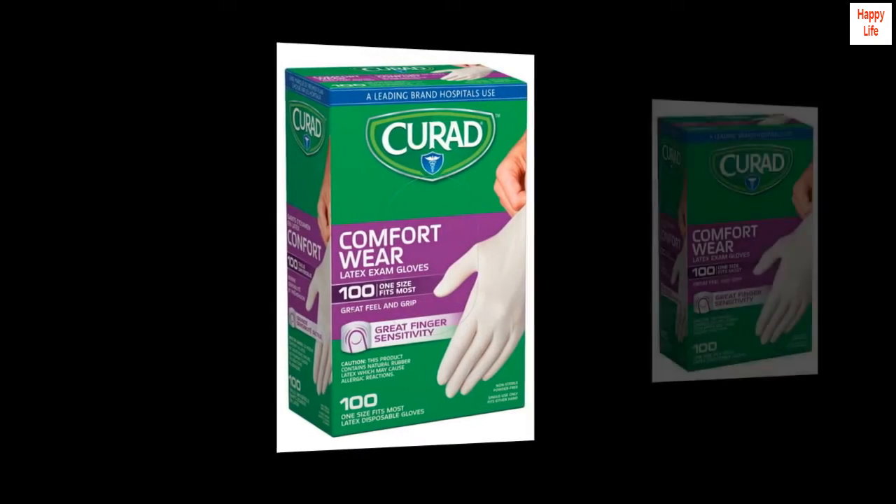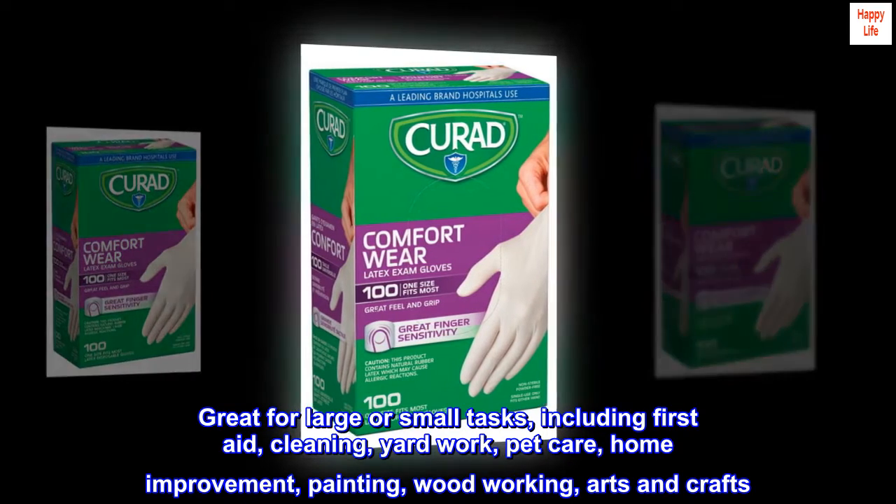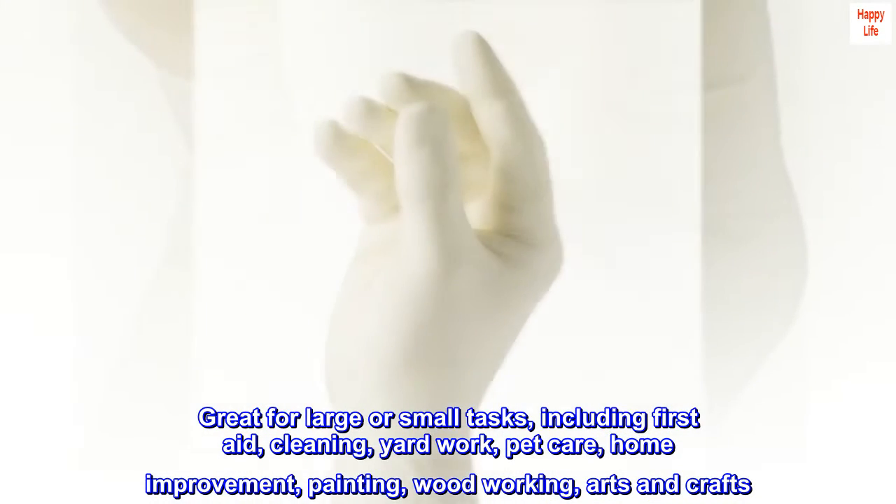Curate Latex Exam Gloves are durable and chemical-resistant. Great for large or small tasks, including first aid, cleaning, yard work, pet care, home improvement, painting, woodworking, and arts and crafts.